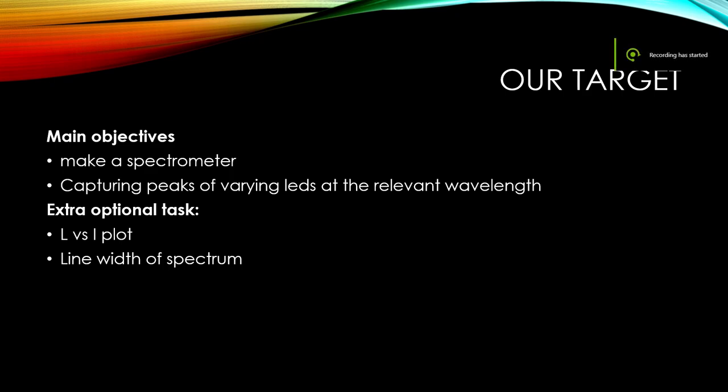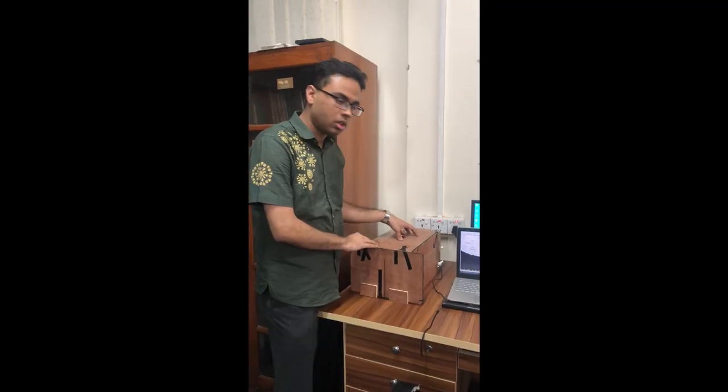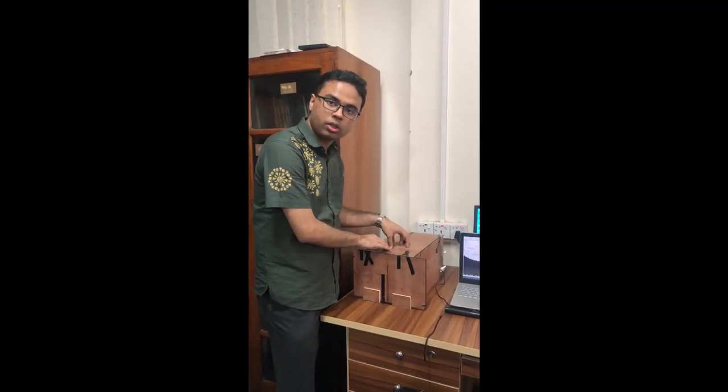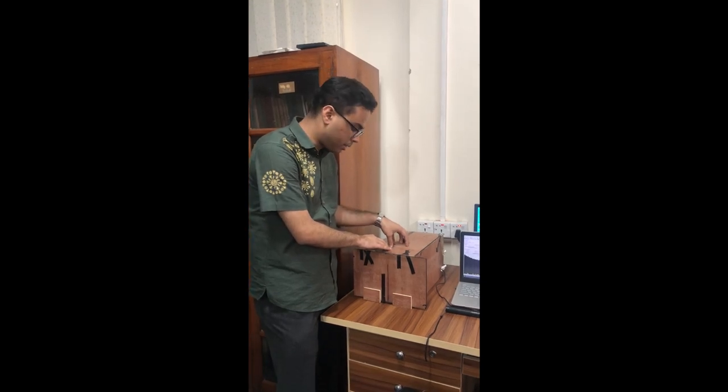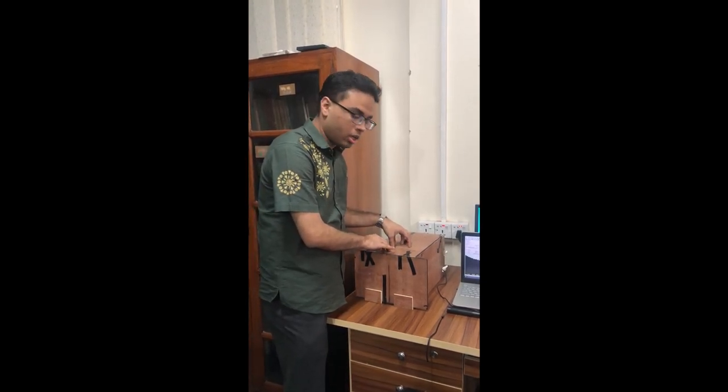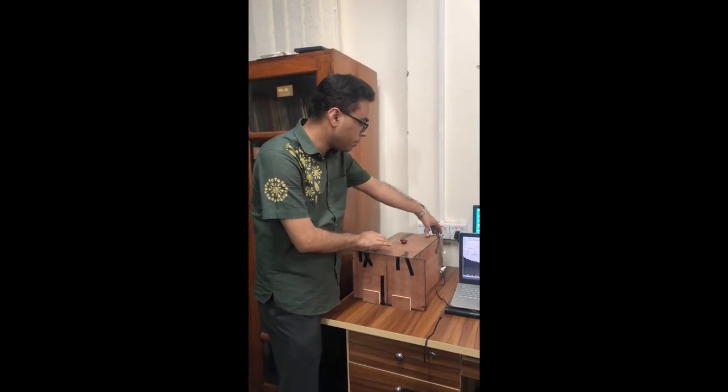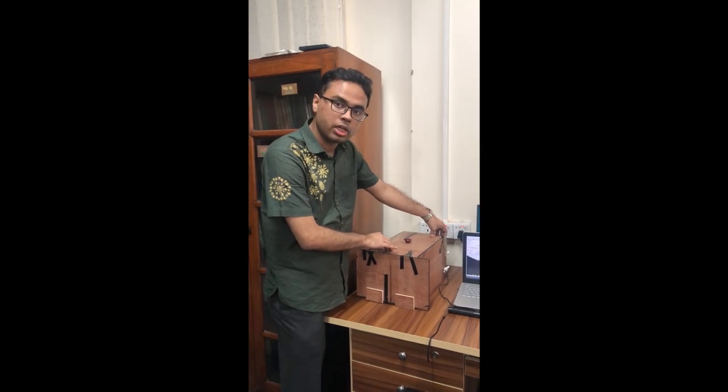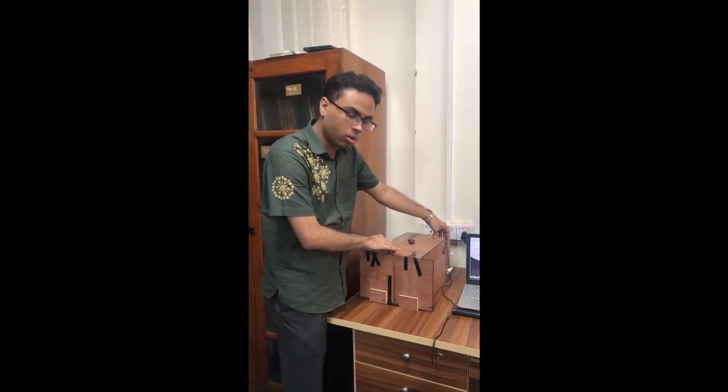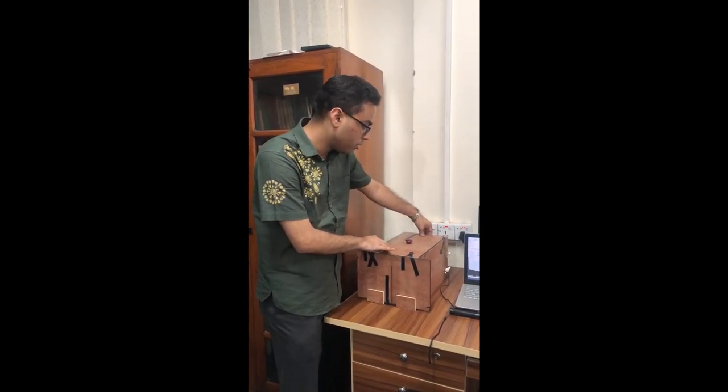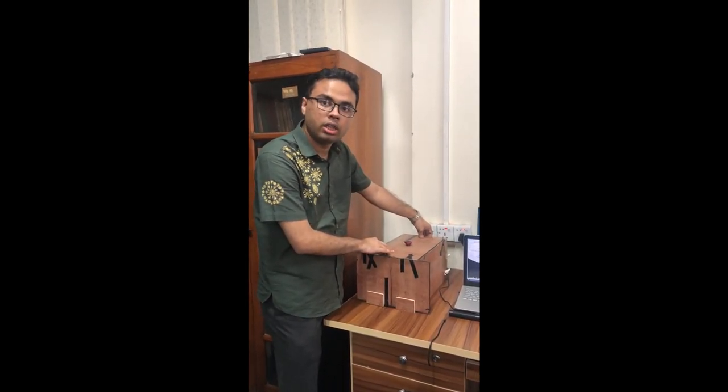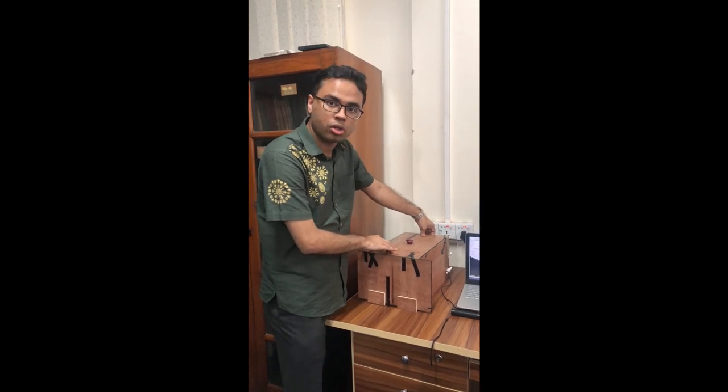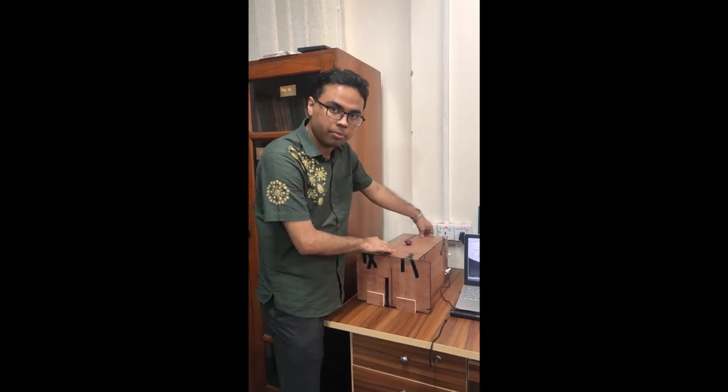Now, in this following video, we will try to demonstrate our optomechatronics project. We have fixed the position of the camera in a rigid way and we have made the structure pretty much rigid so that it will not malfunction in the event of minor shock or vibration.